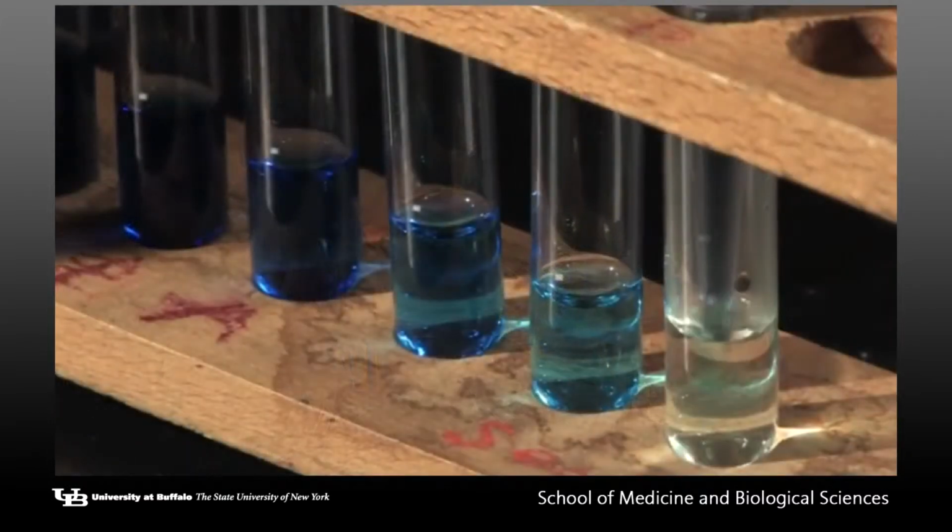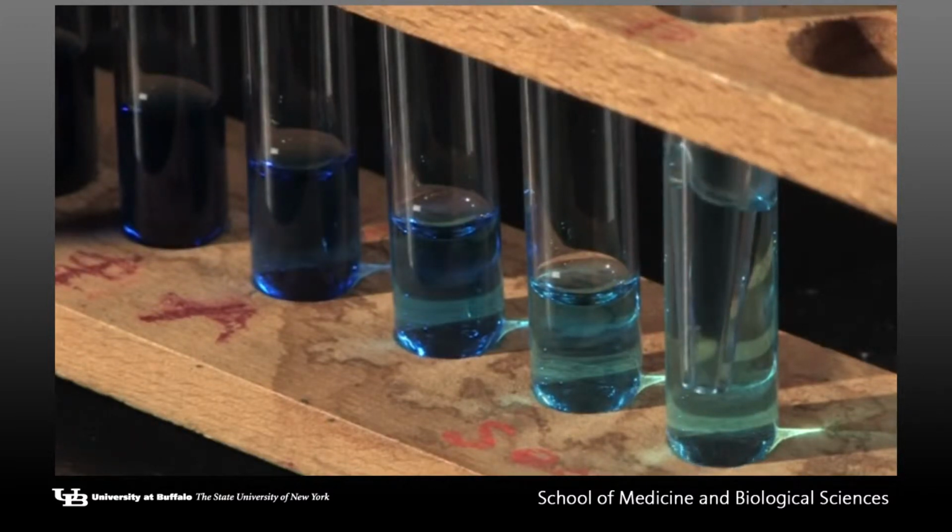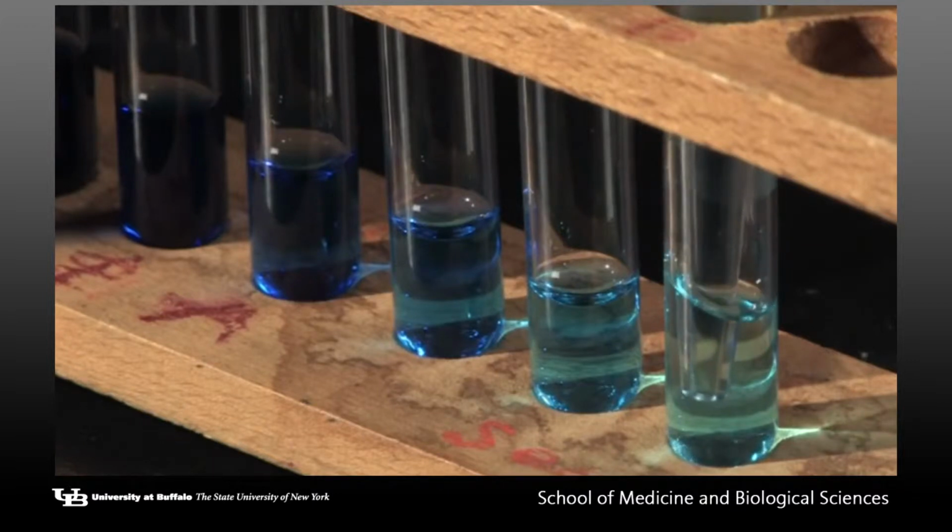In looking at your serial dilution, you are able to see a decrease in the intensity of the blue color from tube 1 to tube 10.